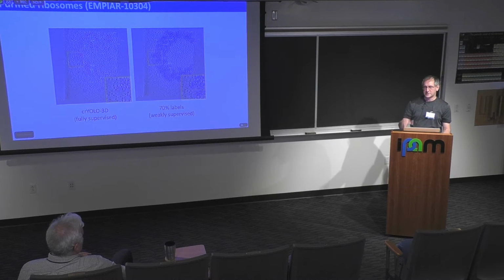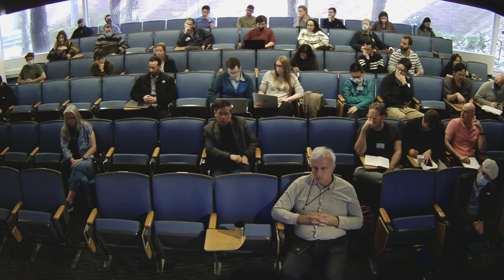Yes, in the end that's the idea. But I think you're touching on one important point, which is that to get to high resolution you need small pixel sizes, right? But then you also want to cover enough area. So that's where the high throughput comes in, right? Without high throughput, you just won't be able to cover enough area to give you enough data to do high resolution sub-tomogram averaging. Am I not aware of some cryo serial EM features?